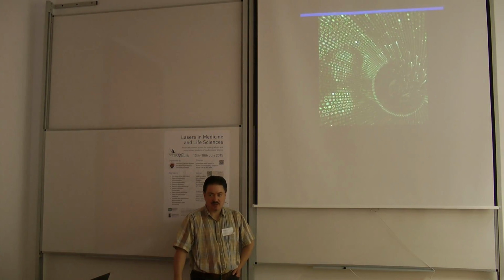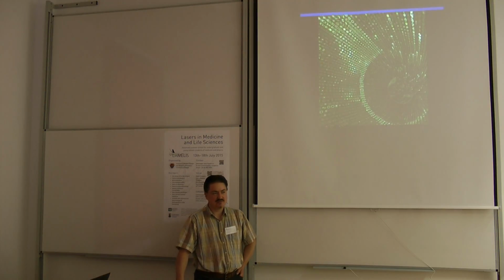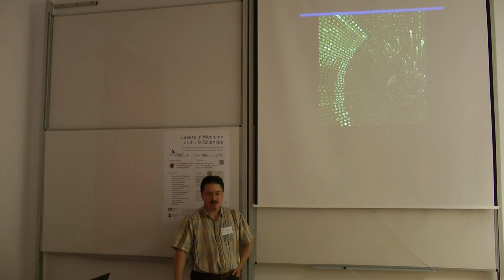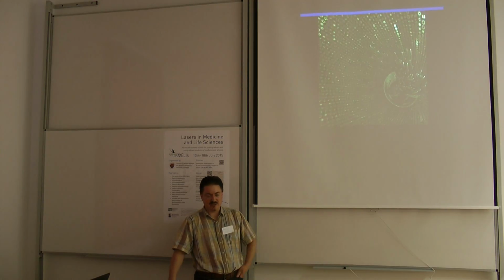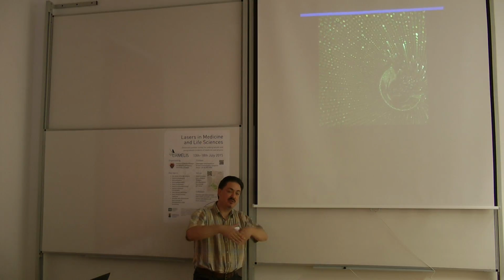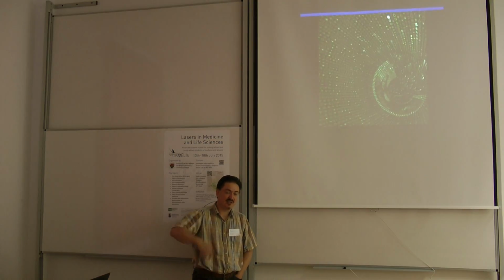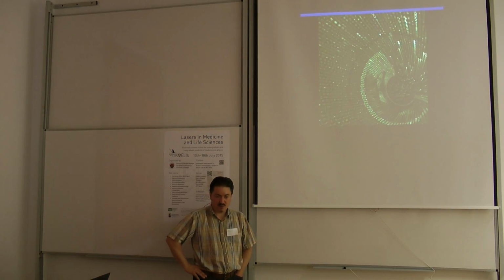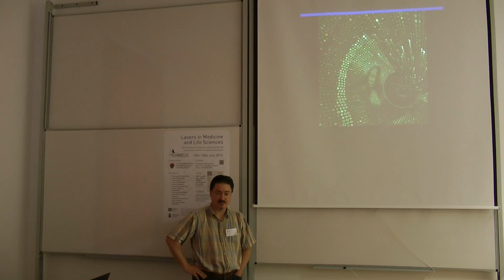So we are talking about 40 to 100 micrometers per one. But it doesn't stop you from doing anything smaller. Actually, we are no longer using the segments, which came to be different arrangements. We are using simultaneous generation of 2 plane waves, and then using Fourier transform to reconstruct the whole population. But yeah, you can have pretty much as many as you want if you don't exceed the limit of resolution of the spatial light modulator.